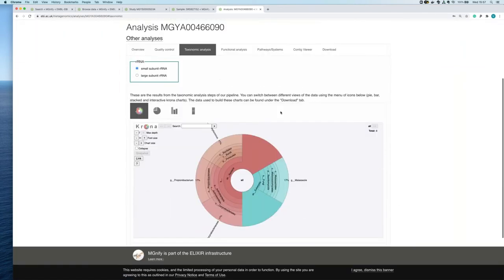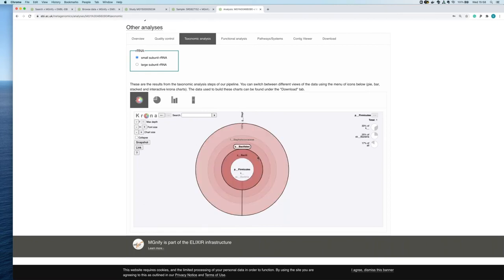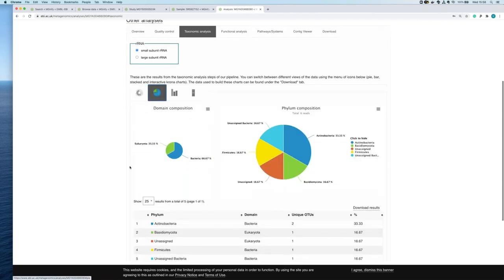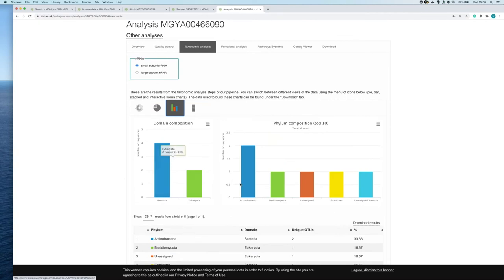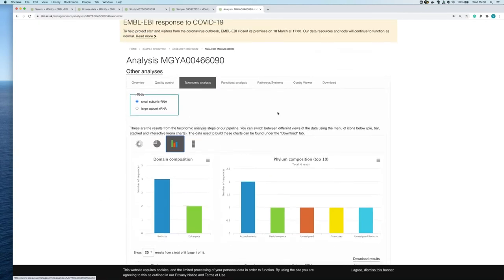The taxonomic analysis tab shows the small subunit ribosomal RNA results. The krona chart is interactive so you can drill into a particular phylum to see how many read matches there are. You can also view the phylum composition as a pie chart or a bar chart. If this were amplicon data, there would also be a separate ITS box to navigate.